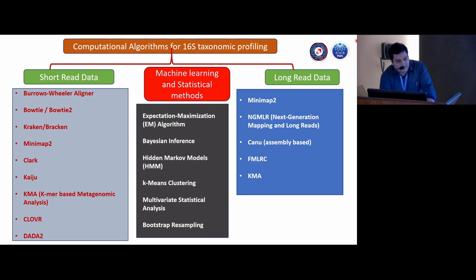It is highly efficient, and there is a new one in the market called Hero. Its name is Hero, and it gets you more accuracy. So with time, the accuracy of nanopore will be comparable in contrast to Illumina. So that is the way.